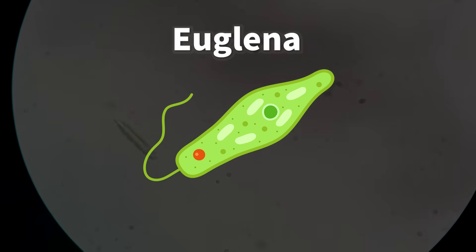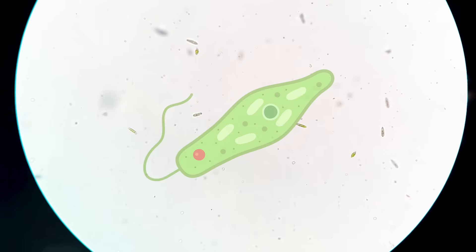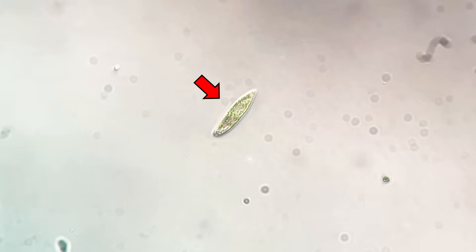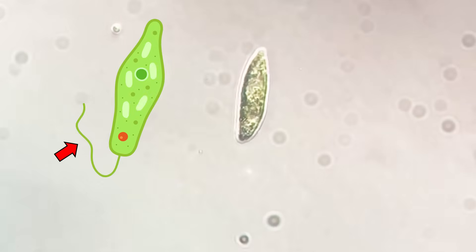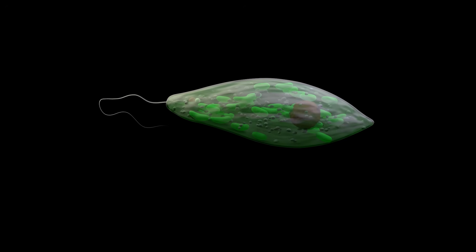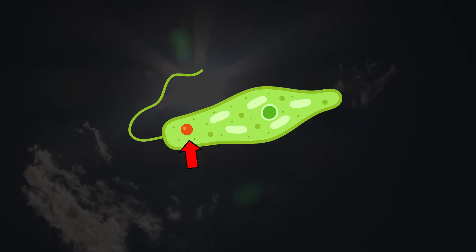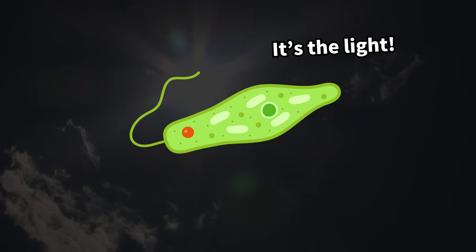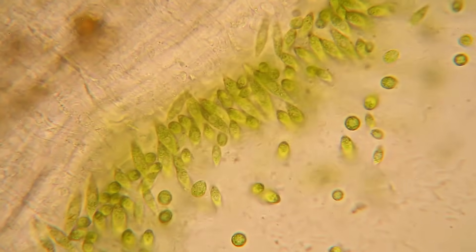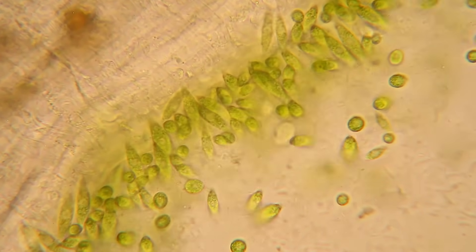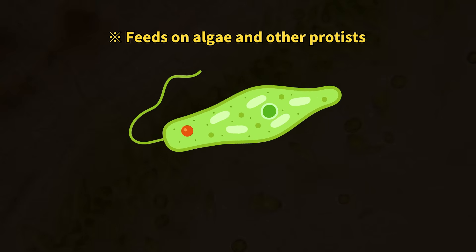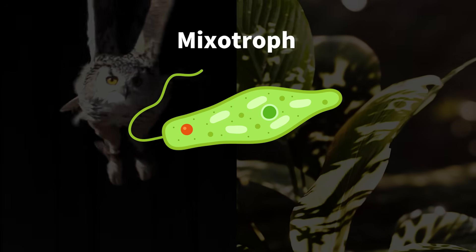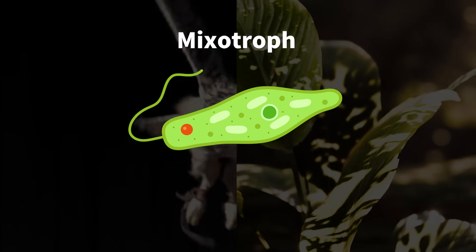Next is a creature called euglena. Euglena is especially unique. Look here — this green creature is euglena. When you look closely at a euglena, you'll notice something moving at the tip. Euglena has a flagellum at its front end, which it wiggles to swim around. Its green color comes from chloroplasts in its body. Thanks to a special light-sensitive spot called an eye spot, euglena can move toward the light and use photosynthesis to make its own nutrients. Even more surprisingly, when there's no light, it can hunt for food and take it into its body. Euglena is a truly unique organism that has both animal and plant characteristics.